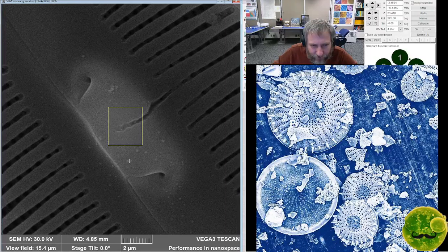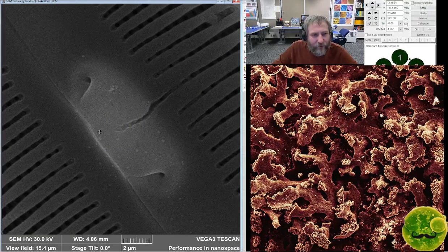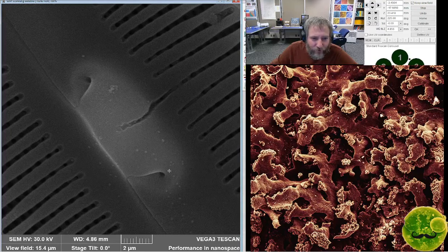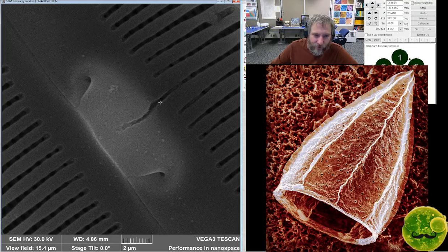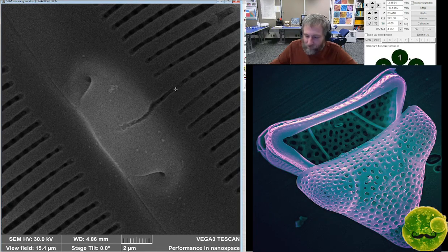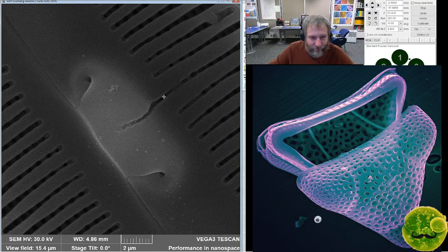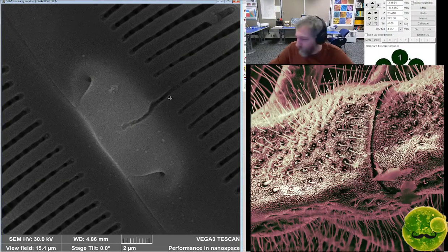It's our little unicorn. This is the inside view of that giant unicorn gomphonema. This is the proximal raphe end right here, the central nodule, and there is the slit-shaped stigmoid, and on the outside there's just a hole right here, and then it's associated with a striae. So same pattern we saw in basically almost every gomphonema that I've looked at closely that has this slit-shaped stigma.